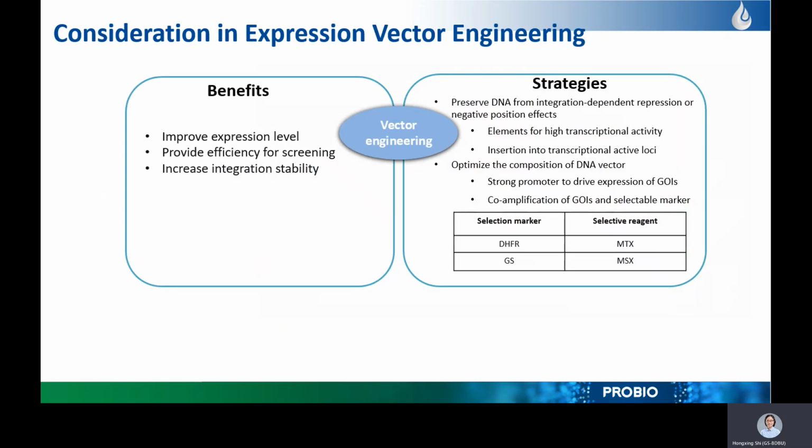For the key elements of the starting technology, the vector generally includes a promoter for the expression of the target gene, poly-A, restriction sites, and the screening genes. Whether the design of the vector is reasonable, especially the design of the target gene expression cassette elements, will affect the yield of the cell line and the ratio of high-expressing clones, which will affect the efficiency of screening.